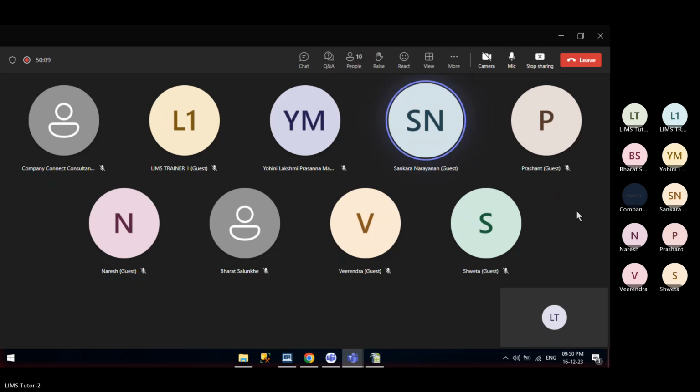Shankara, we will not cover how the module was configured, but we will show you only how the lot or the sample will flow from one place to another, from start to end. Means the workflow which is already designed and has been accepted by pharma organizations. Only the flow part we will show, but not how the workflow was designed.